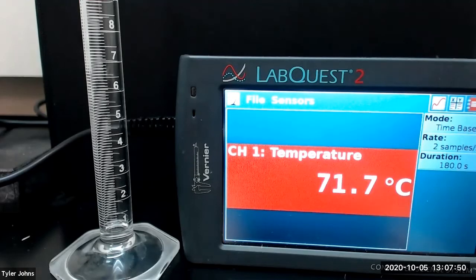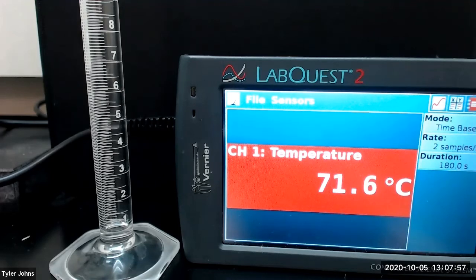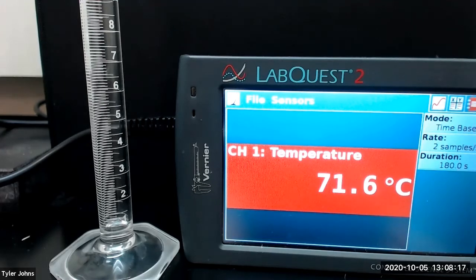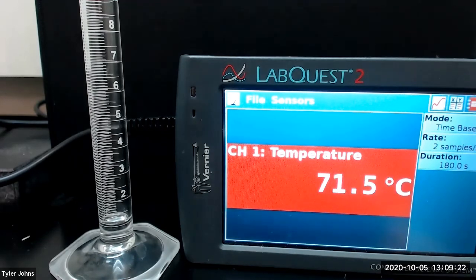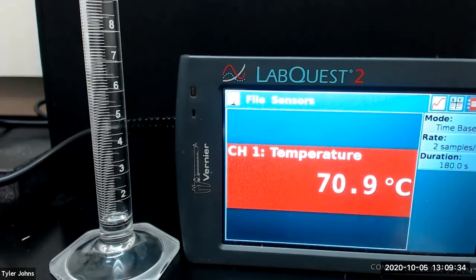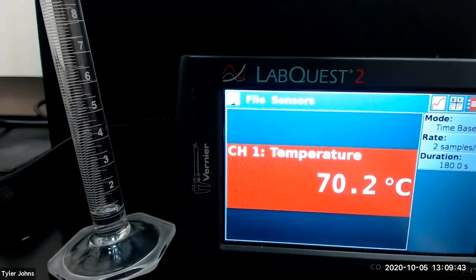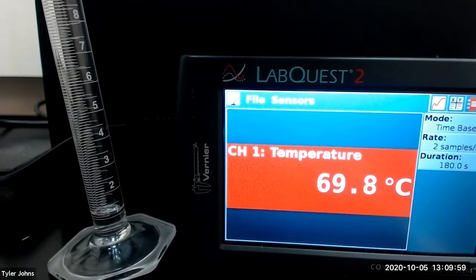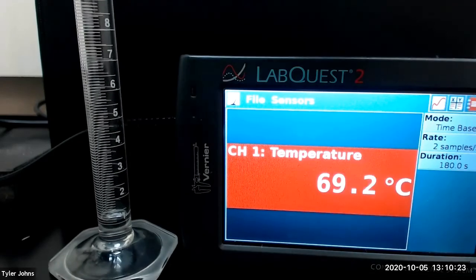We've collected the first 0.5 milliliters and will now record the temperature every 0.5 milliliters. We're now at one milliliter, so we need to collect three to four drops of distillate.